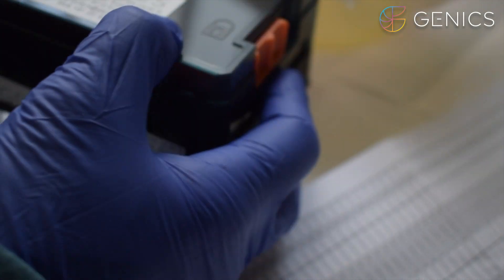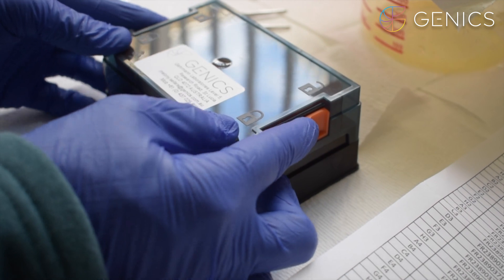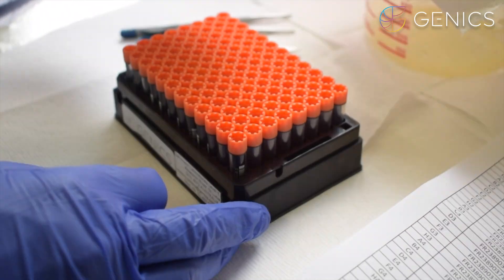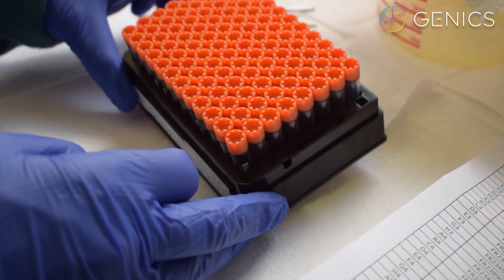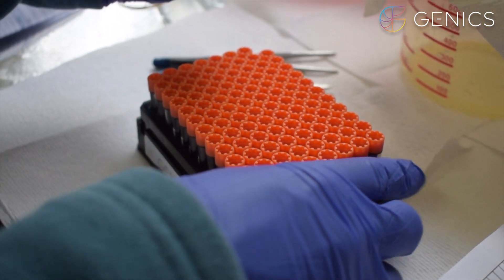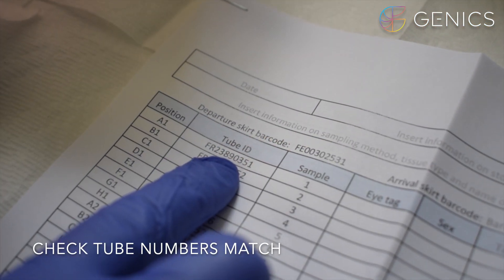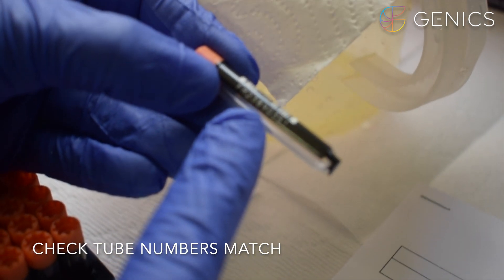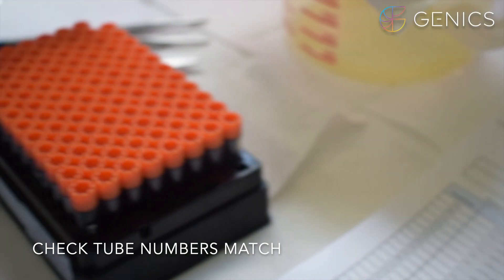You can then take your tube rack and unlock it by pushing the orange tabs into the unlock position. This allows you to remove your lid. You can then remove the tube from the top left corner which is in position A1 and check this tube barcode here matches the one on your tube FR23890351.